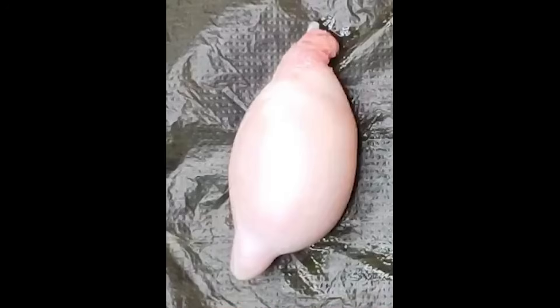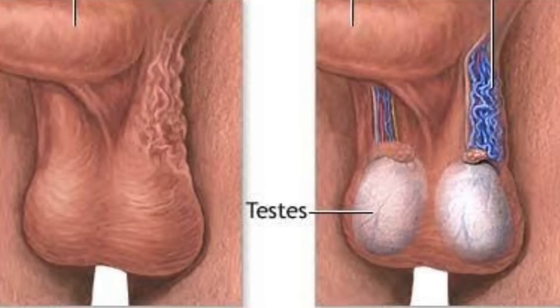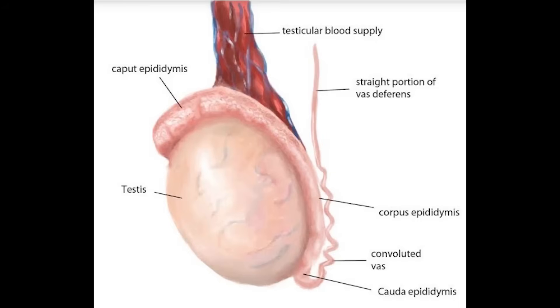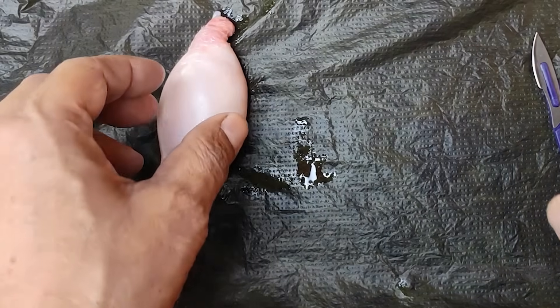Here we have the testes of the goat. We will do the dissection of the goat's testes. They are formed in the lower abdominal cavity and are located in the pouch called the scrotum. Here is about the testes — the testes of the goat.